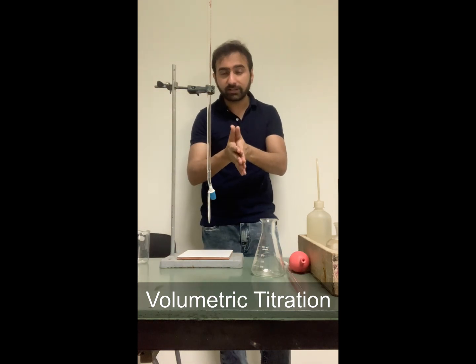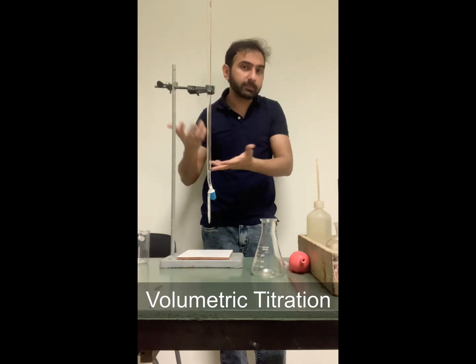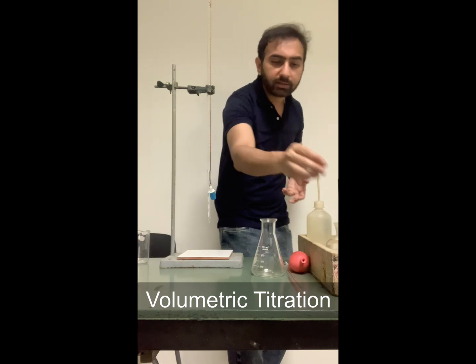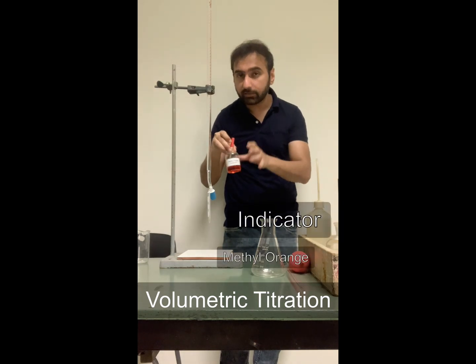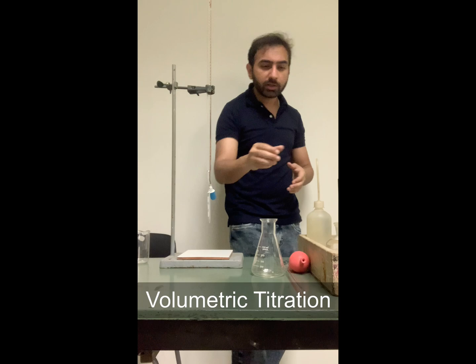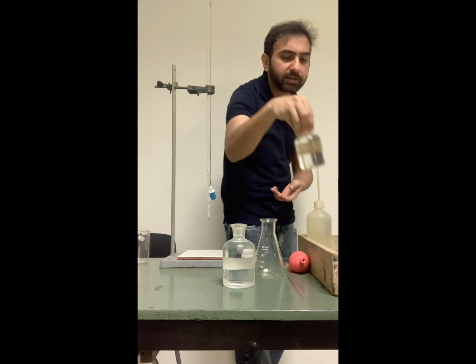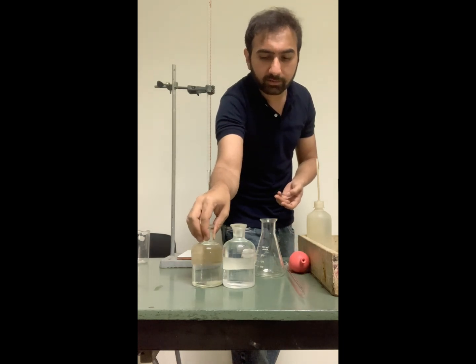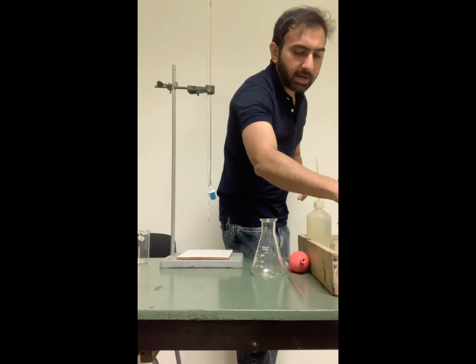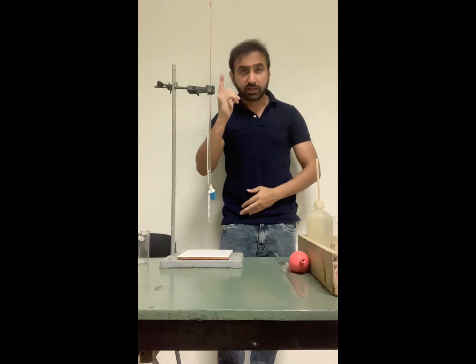Now, things to keep in mind when you're doing a titration: in a titration you are using two liquids, and both of those are mostly colorless unless it is a potassium manganate or iodine kind of liquid. So both of them are more or less colorless. For colorless liquids we will be using a chemical known as an indicator. This titration is pretty simple because it is our first interaction with lab apparatus. I am using these two liquids — one of them is sodium hydroxide and the other is hydrochloric acid.